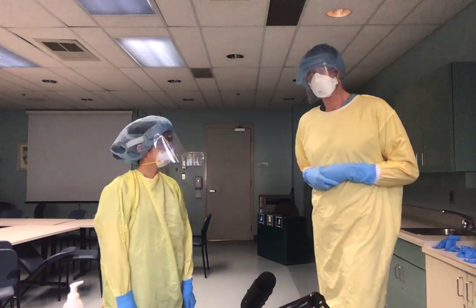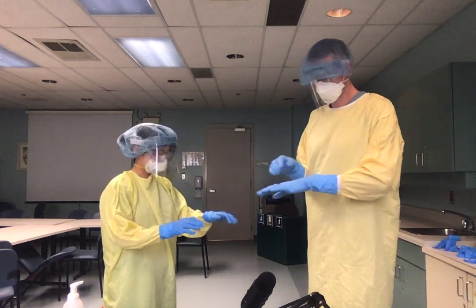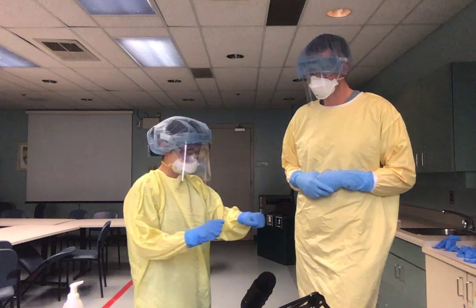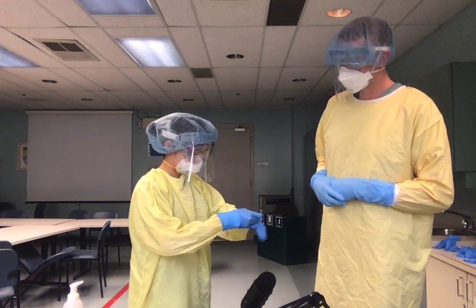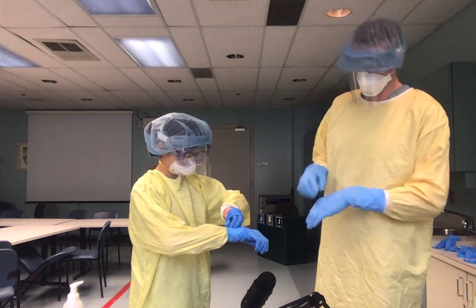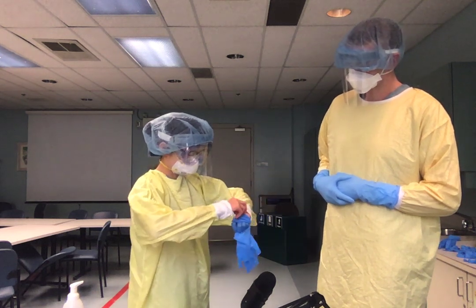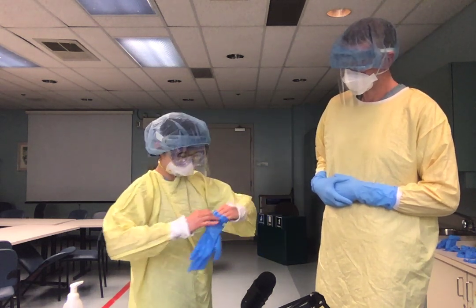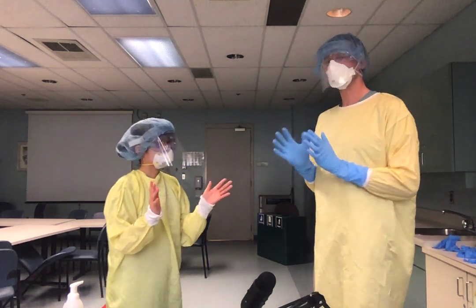Okay, so Nancy, the first thing I'm going to get you to do is take off your gloves, and you show them exactly how we're going to do that. This method involves no skin to glove contact, so it's a very nice way to do it. So she's grabbing on the top here. Excellent. So if all goes well with that, her hands are still pretty clean, but we don't assume anything.